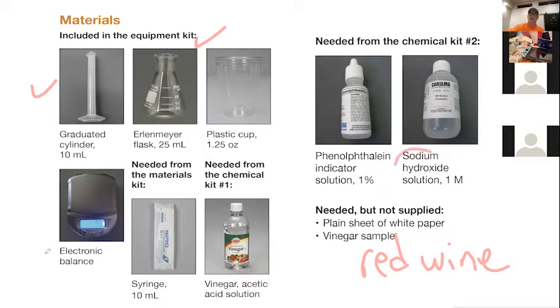This is going to be our titrant, 1 molar. We're going to treat it as a 1.0 molar solution. So we'll use 2 significant digits for the concentration. And then this is our indicator.